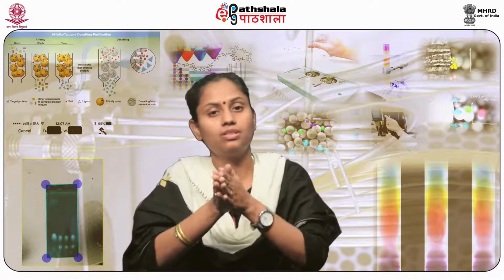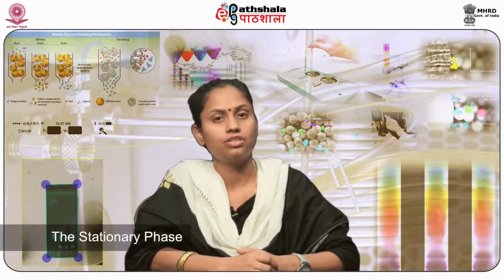The compound which has higher or stronger affinity towards the mobile phase compared to the stationary phase will elute or come out first, compared to those compounds which have higher affinity towards the stationary phase. Now let me familiarize you with some of the commonly used chromatographic terms which are used in various different types of chromatography. Let us first start with the stationary phase.